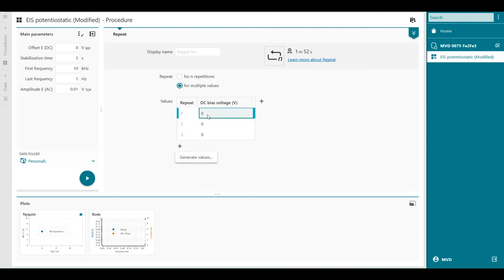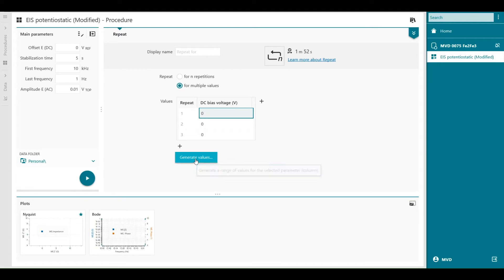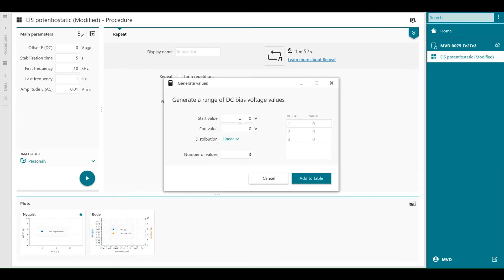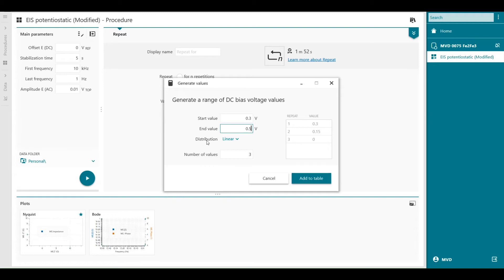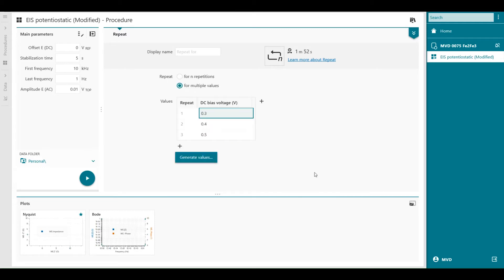We select the field and then we can generate values. We can start for example with 0.3 volt up to let's say 0.5 volts. The distribution is linear and we have three values in between so when I add to the table it's creating these values as a DC bias voltage.